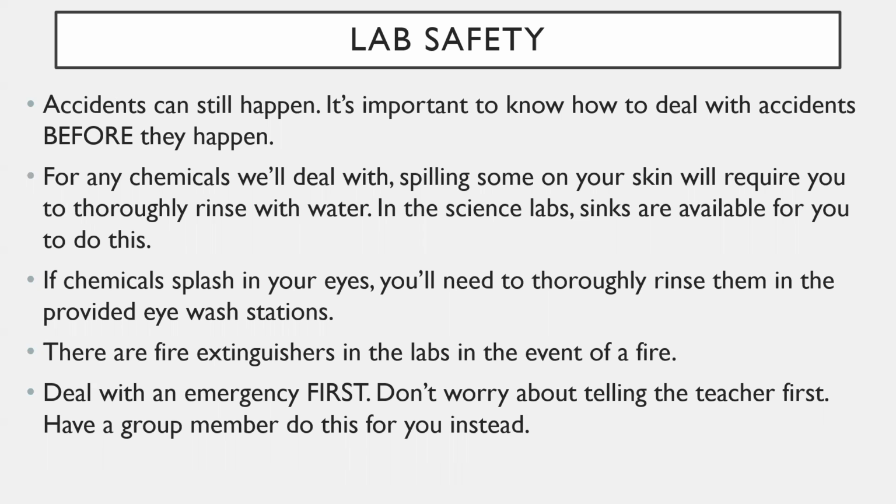Now in the science labs, of course, sinks are available for you to rinse things with water, right? So if you spilled a little bit of chemical on your hand, immediately go to the sink and wash it off. That's the absolute first thing you need to do.